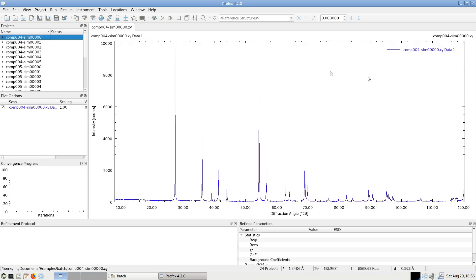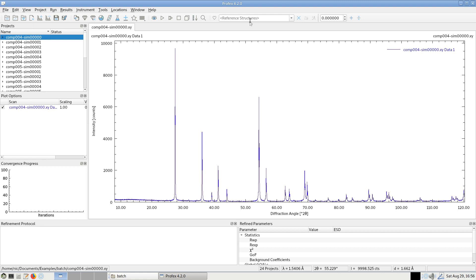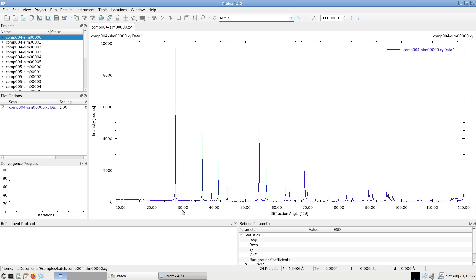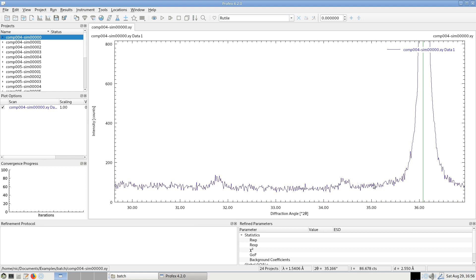Each of the data files is opened as a separate refinement project. We start by identifying the phases, and since these are synthetic mixtures I already know what to expect. The main phase is rutile titanium dioxide. As you can see the peaks of the rutile reference dataset match perfectly. And we have a very small signal down here, low peaks of zincite.